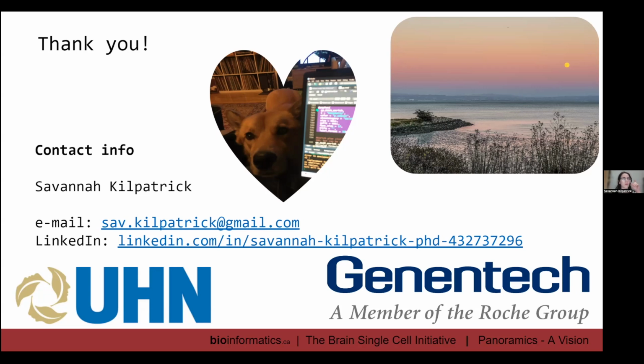You can also filter through your more highly expressed genes and see which of those are present in your tissue. Because again, you might not be capturing everything in spatial, but you can absolutely incorporate your data from bulk to apply to spatial. We ourselves have done that with some of the genes of interest, and it's a nice sanity check as well. If you already know that there should be some genes that are differentially expressed, you can look for them, and in that way you can get more information about the cell types that are dysregulated.